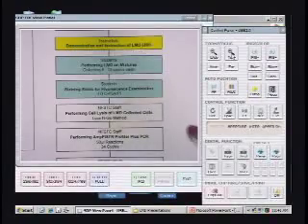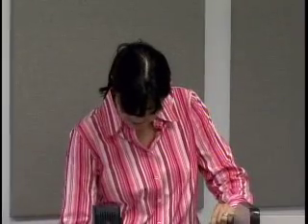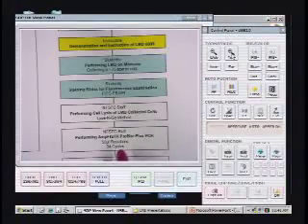Carrie at NFSTC here will be completing the cell lysis, basically handing off the samples. She'll be completing the cell lysis and performing the PCR, and be aware, we're doing 50 microliter reactions, but we're doing 34 cycles. We don't have this lab set up totally for low copy number work, but for exercise purposes, try to be as careful as you can. At least you must wear gloves throughout the whole process. There are masks in there if you feel that you're some kind of shedder, and also when you're doing any tube loading and pulling samples in and out, it's a good idea not to be talking.